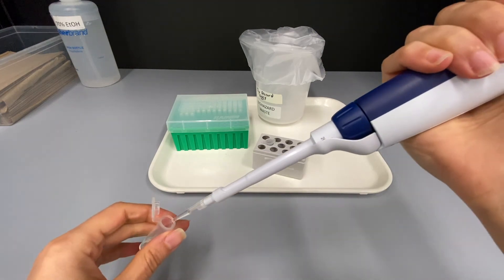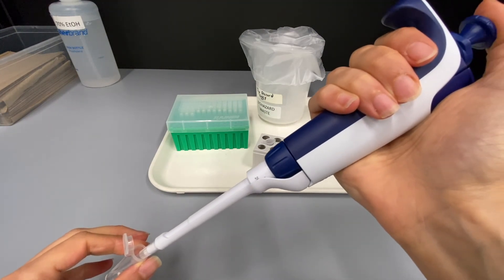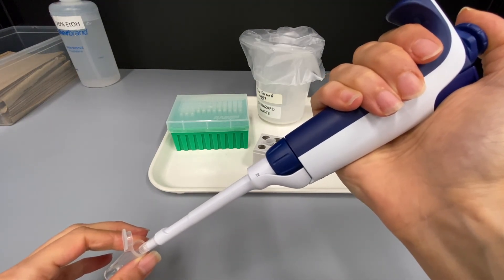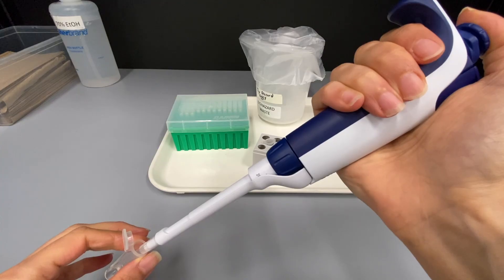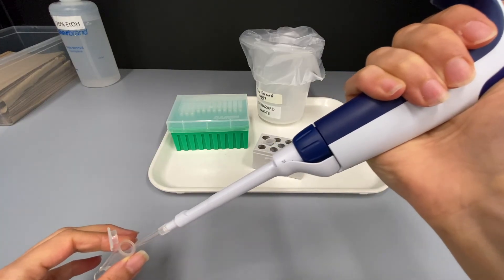Open the next tube, put your tip against the tube wall, then push the plunger down to the first stop, pause for a moment and then go all the way to the second stop to expel any remaining liquid.